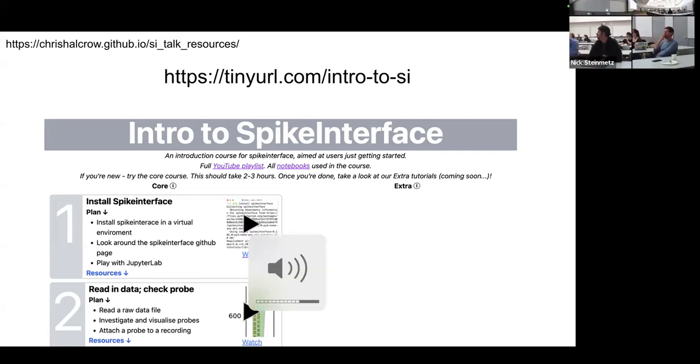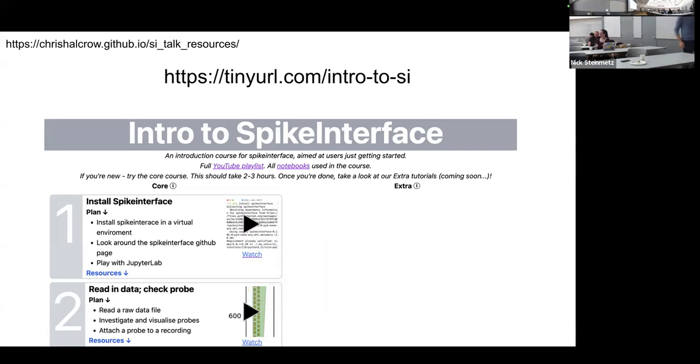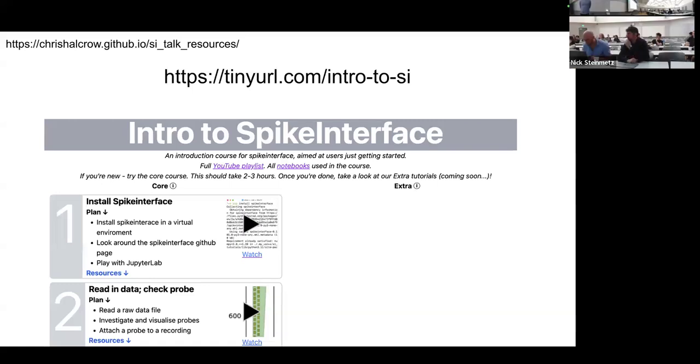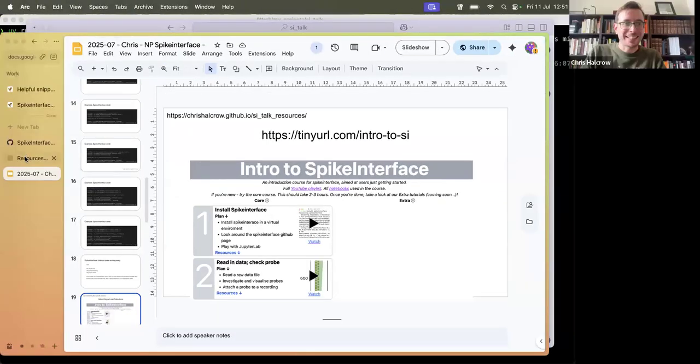I tried with some recording data to Spike sort, using Spike Interface, but I didn't make it work because I have to convert to another format. Sorry, you wanted to convert to another format, or the initial recording format you couldn't load? We had a recording with the Plexon like 5 years ago, so they asked me to use that file. And I tried to use the Plexon PLX file, but for me it didn't work, so I had to convert to another format. Yeah, that's sad.